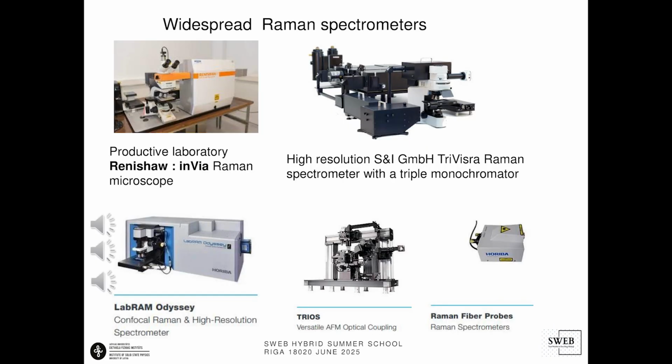There is a wide range of Raman spectrometers on the market. Companies offer spectrometers that are optimized for different client needs. In this slide we see several Raman spectrometers. Here you see the popular Renishaw spectrometer and the Trivista spectrometer, which is similar to our Raman spectrometer.